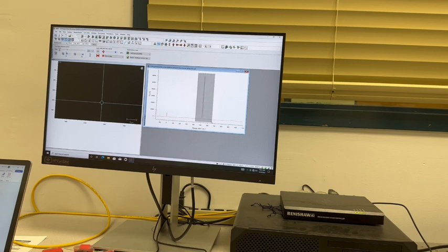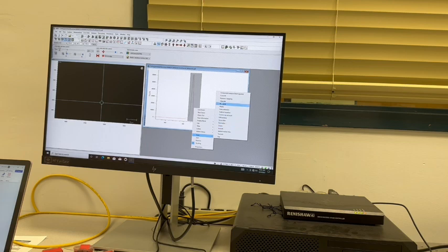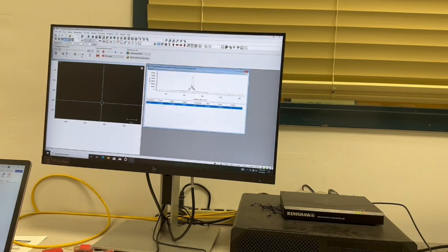Draw a box around the peak, around 500. Right-click and select Tools, Curve Fit. Next, click inside of the curve to place the relative curve fit. Right-click, Start Fit. The fit is now shown below the curve.